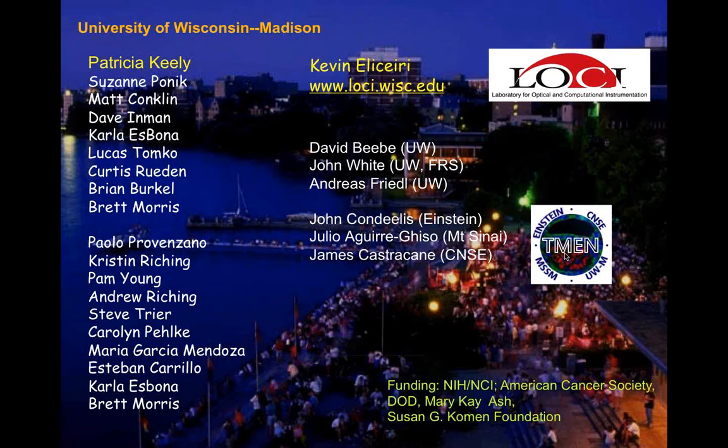I actually don't see a difference once I sacrifice the animal and fix the tissue. It seems to be something that is an in vivo specific event. So when I do try to do the controls to compare and contrast the endogenous fluorescence intensities, we really lose that contrast. They all look very similar.